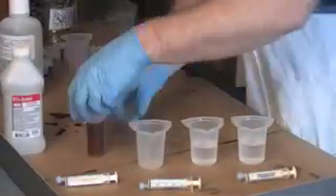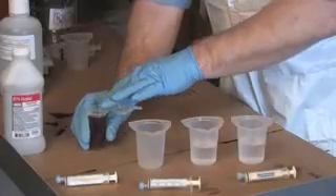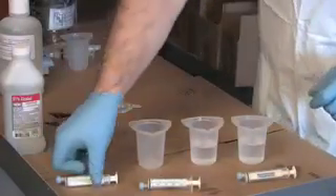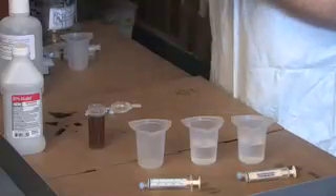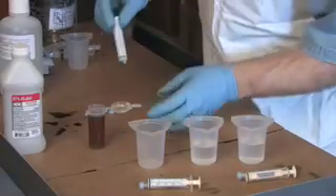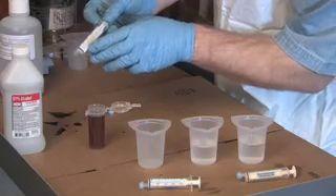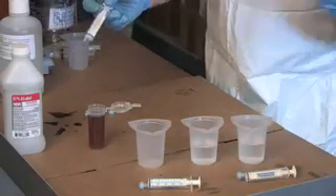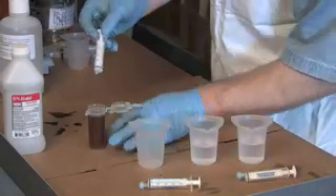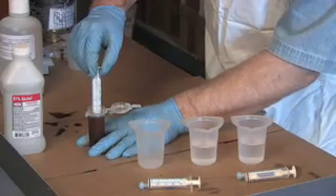To do a titration, you have a sample of oil that you don't know the acidity of, and you're going to get a syringe and suck up one milliliter of oil. These syringes have milliliter markings on the side — they actually say oil, alcohol, and titration solution. If you'd like these, I carry them on my site at Utah Bio, but any syringe will do.